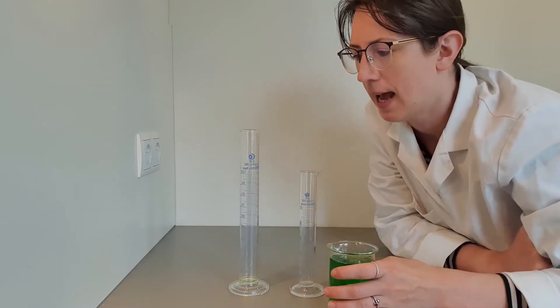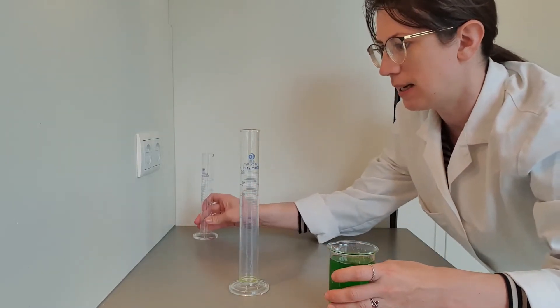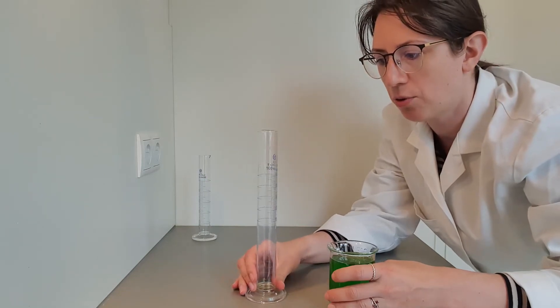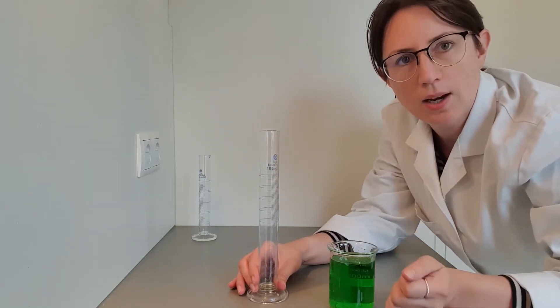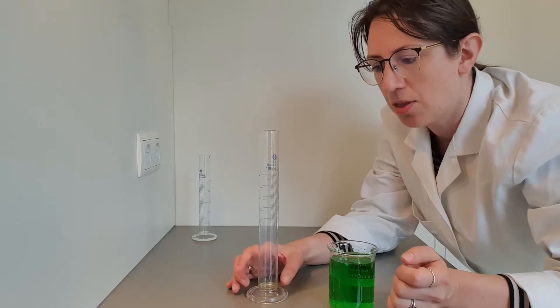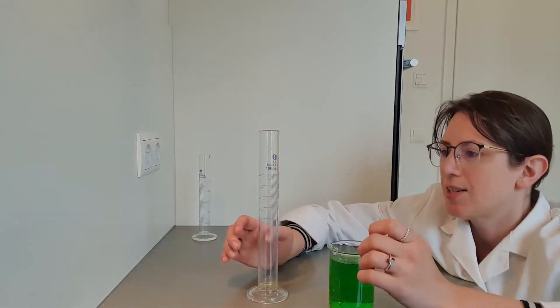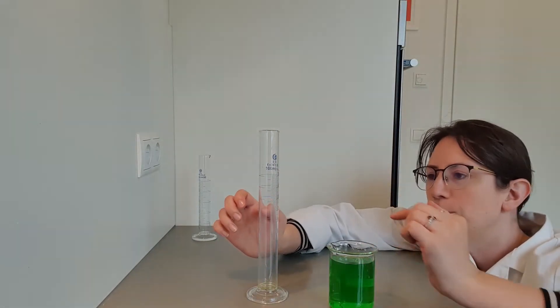And I'm going to use the 100 milliliter measuring cylinder to pour my volume in. Now, let's say I want 60 milliliters. The best way to do this is to get down to eye level so that my eye is right level with the line for 60 milliliters.